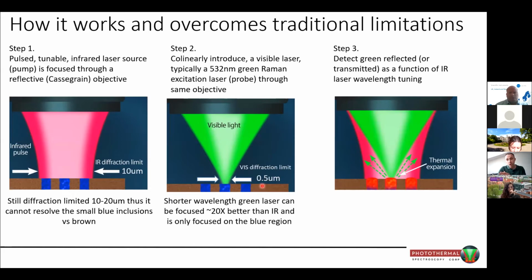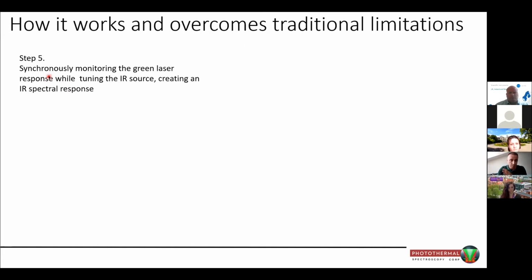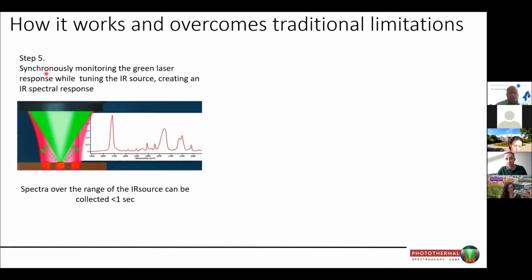And as we tune our infrared wavelengths, we synchronously monitor the green while we're tuning the IR source, right? And that creates an infrared spectrum. It becomes almost a pure absorbance spectrum, right? And that's collected typically in under a second or about a second.